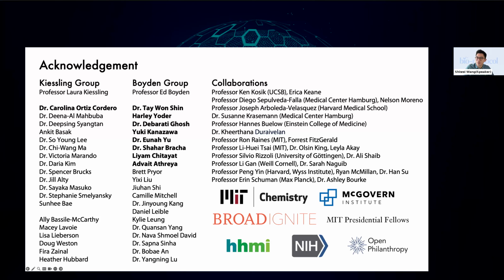Yeah. There are more questions regarding different organisms. Have you or anyone tried bacterial cells or protists? Yeah, we have tried some bacterial cells. I think with bacterial cells, it doesn't seem like diffusion is a big problem. The big challenge is the softening, because they make different cell walls, a lot of them carbohydrates. You will have to think about how to fully digest the cell wall for the expansion to occur. And protists? We haven't tried that, but that might be easier. I'm not sure.